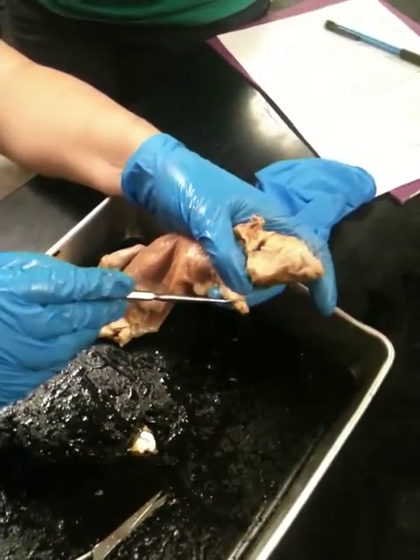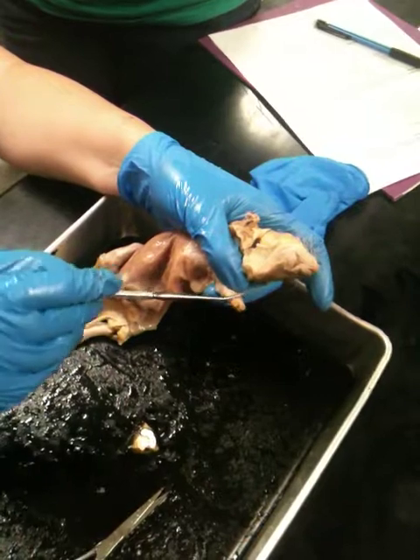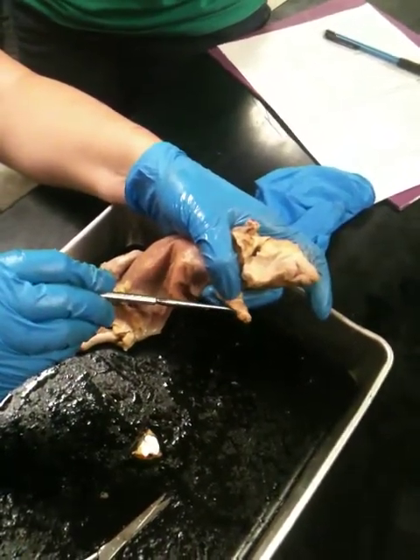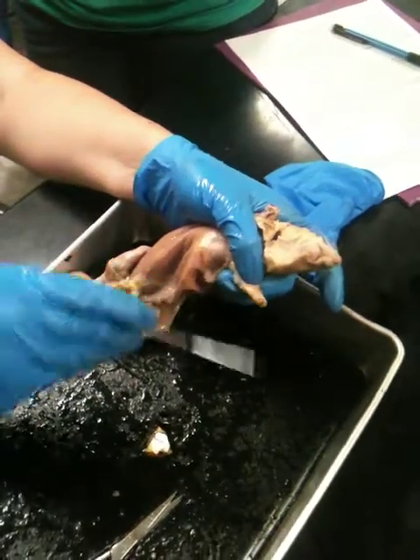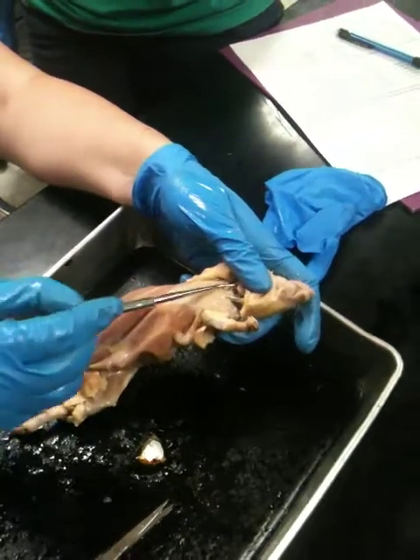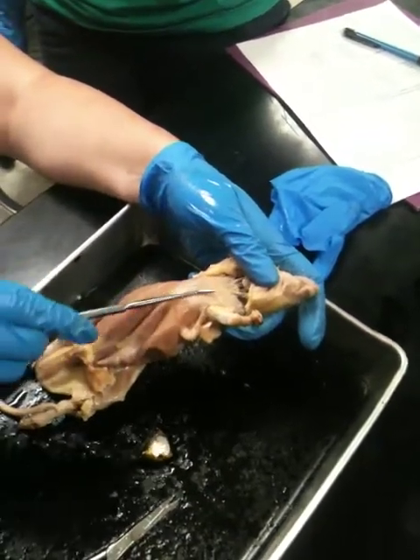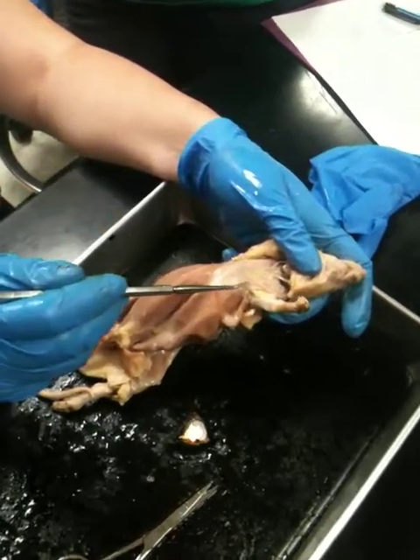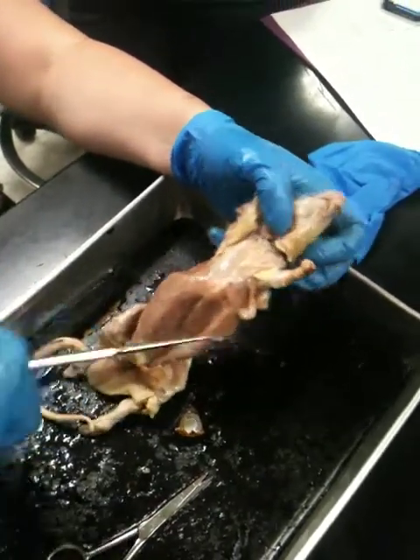This area right here is going to be the carpal, so the wrist. Right before this padding is going to be the palmar. These little fingers are going to be the digital. This over here is the sternal, just dead center. Off to the side is going to be the pectoral. Think about the pectoral muscles.